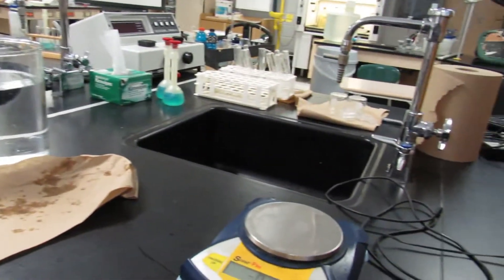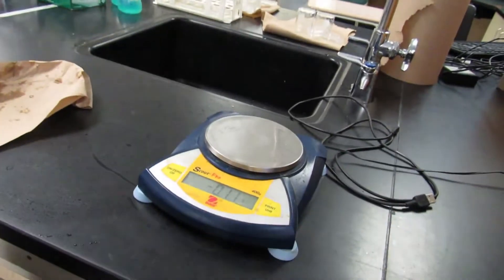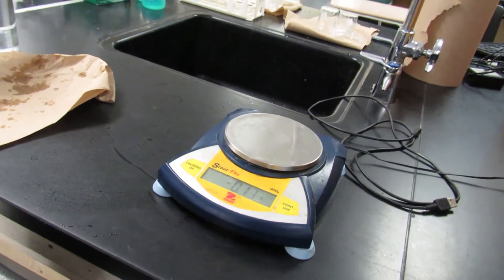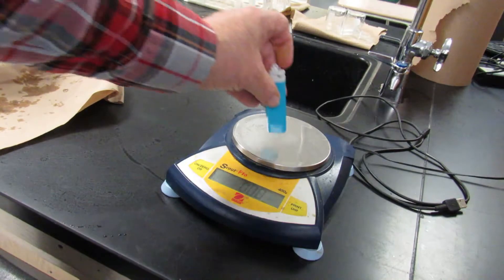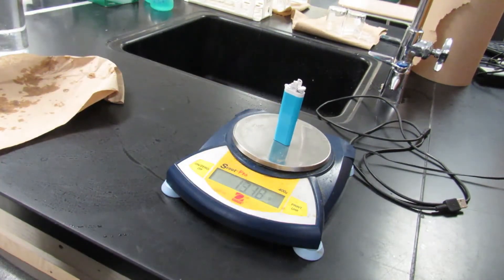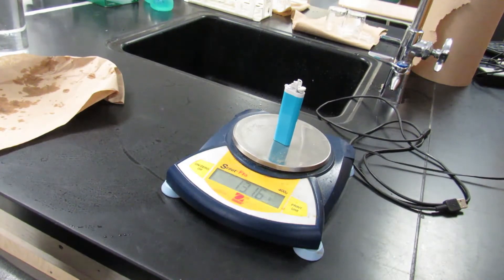And then we're going to go ahead and put it on the balance and find out what is the mass of the lighter to begin with. Zero the balance, go ahead and put it on the balance, and we see that we have a mass of 13.6 grams. That's all we have to do with the lighter for now.